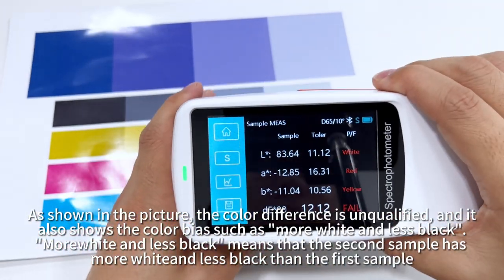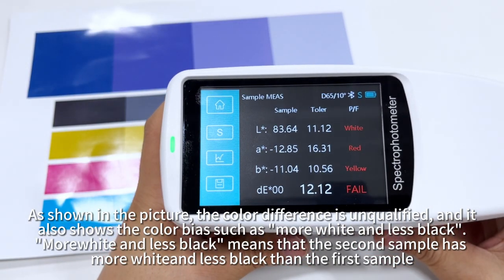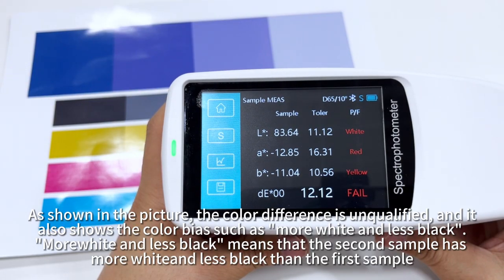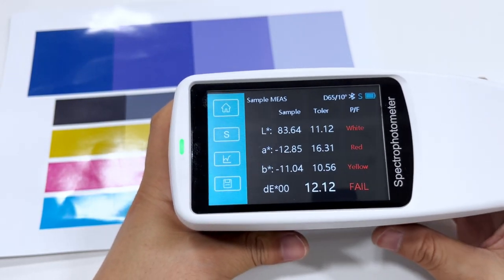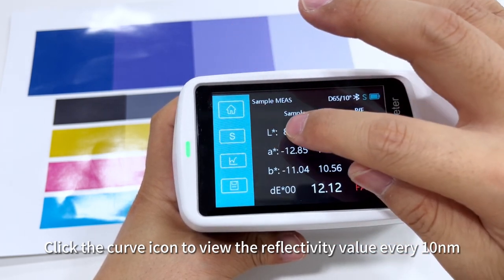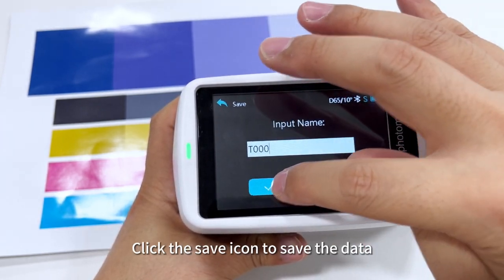As shown in the picture, the color difference is unqualified and it also shows the color bias, such as more white and less black. More white and less black means that the second sample has more white and less black than the first sample. Click the curve icon to view the reflectivity value every 10 nanometers. Click the Save icon to save the data.